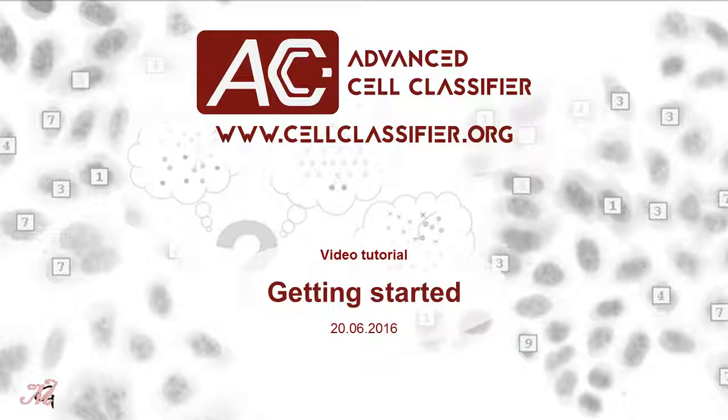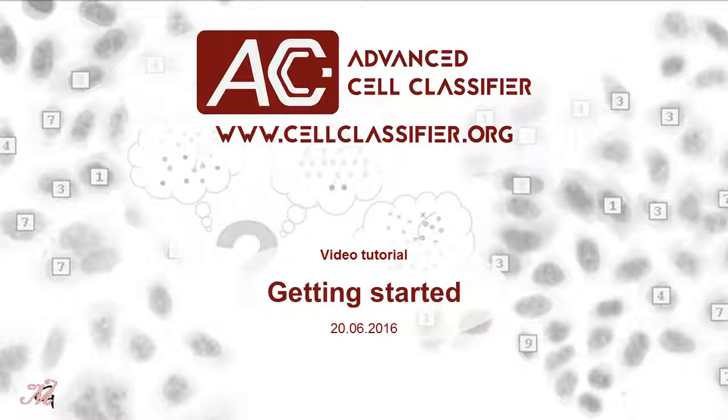Welcome. This is the first video tutorial about Advanced Cell Classifier. I will show you how Advanced Cell Classifier works and what its basic features are.